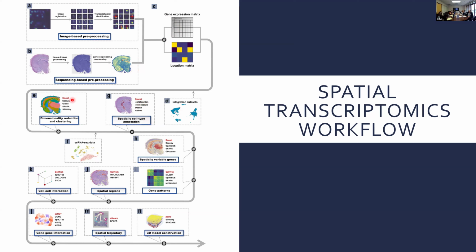And then you're still doing the same things. There are some tools available. The one highlighted is also what I happen to use. I can't remember which paper I got this from, but I've also used ScanPy, that's Python based, but really most of the techniques use either Python or R for the analysis. There may be a few graphical, web-based interfaces to make it a little easier if someone doesn't have a computational background, but most of it's done on the command line.